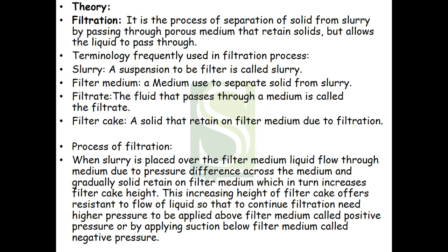So why are we giving either a positive pressure or a negative pressure? Because the rate of filtration depends on the driving force. Now what is the driving force for the process of filtration? It is the pressure difference, the pressure which is upstream and the pressure which is downstream.